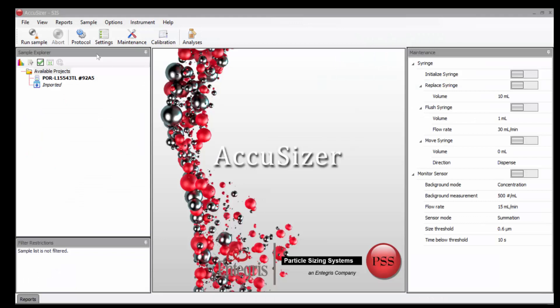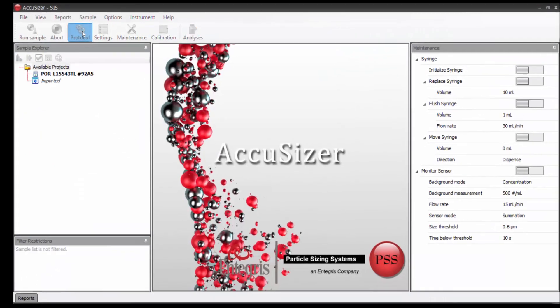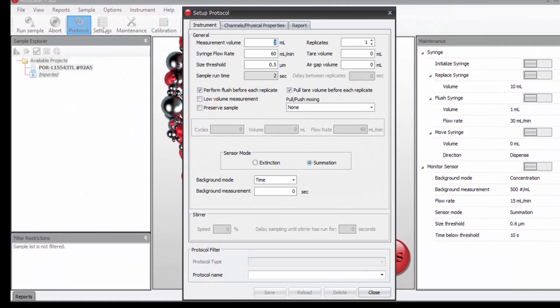We'll come up here and click on protocol. And on the first tab, we first will adjust the measurement volume to 5 mLs per sample.